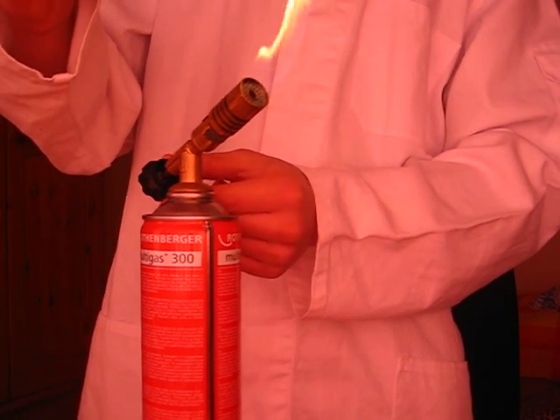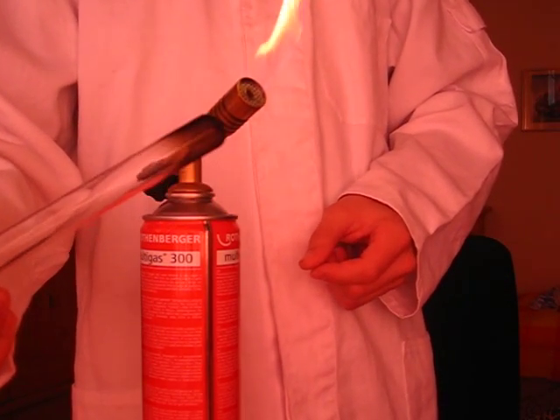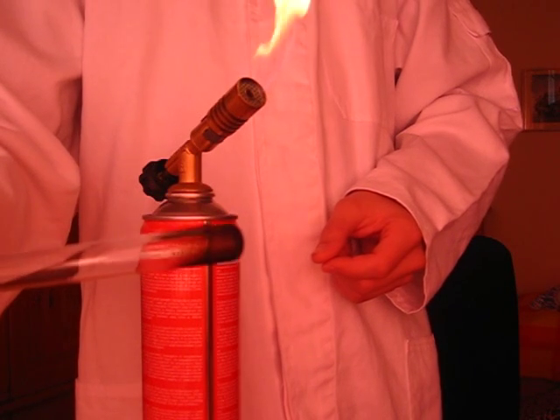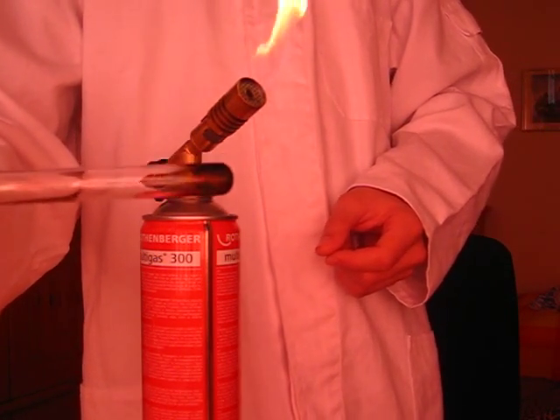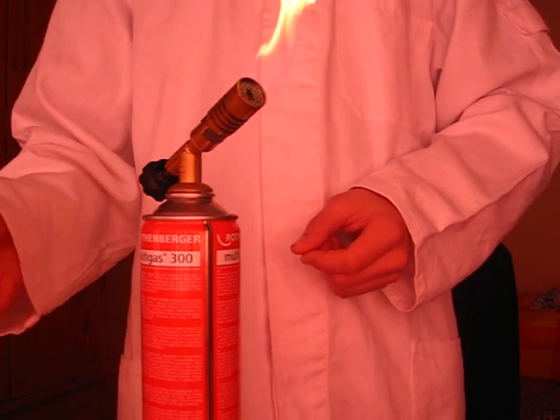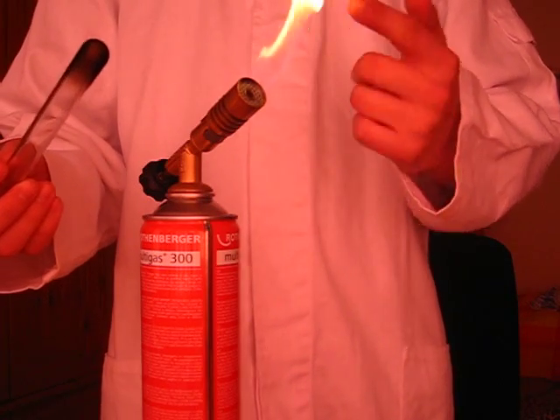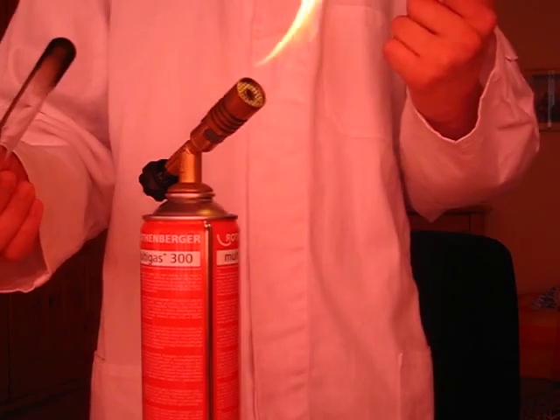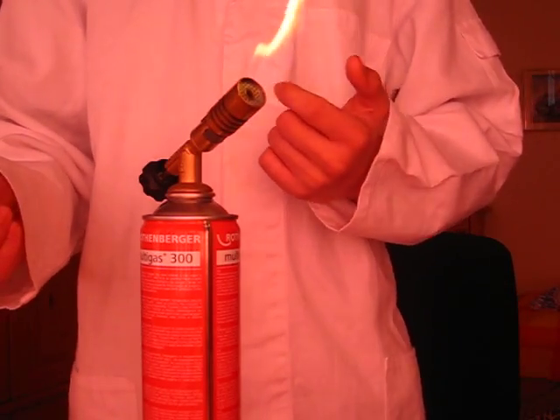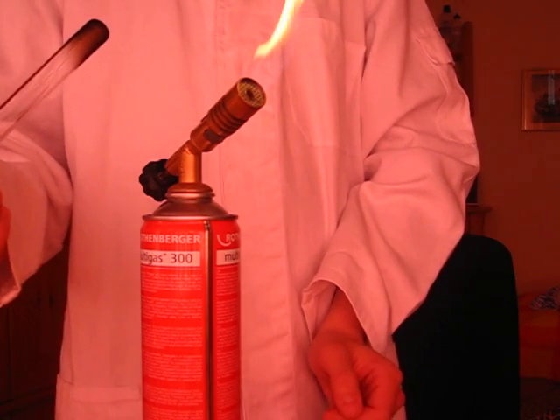And I don't know if you noticed it on the camera, but the test tube is now full of elemental carbon from the butane gas that's in this gas container. And this flame is not the flame that we use. This is the flame which we find in candles. This is the deposition flame, which doesn't really oxidize.